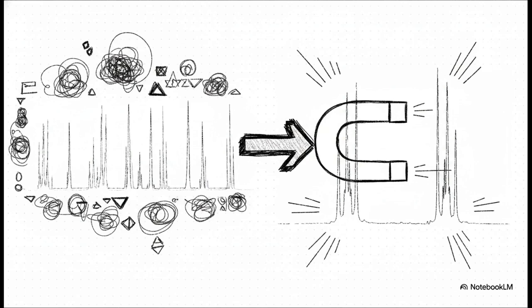When you look at the actual data for a molecule like 2-chloroethanol, the transformation is pretty stunning. On one hand, you have a chaotic, overlapping 60 megahertz mess, a classic second-order nightmare where the ratio is somewhere between 1 and 3. But look at the exact same molecule run at 300 or 500 megahertz. It is beautifully resolved. You can literally see how sheer magnetic power forces the data right back into clean first-order patterns. At 500 megahertz, our ratio hits 12, and that complex web seamlessly reverts into 2 clean, easily readable triplets.